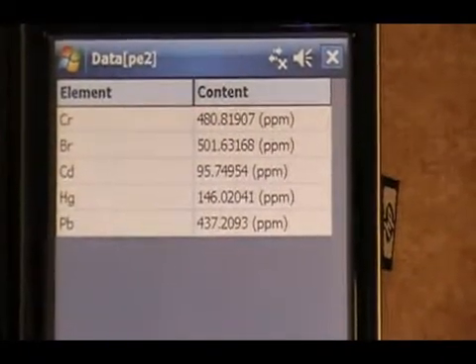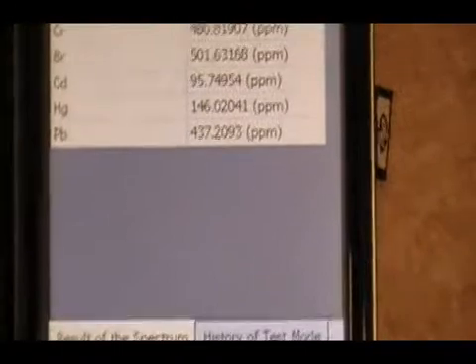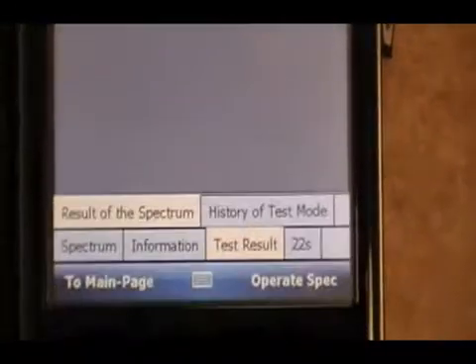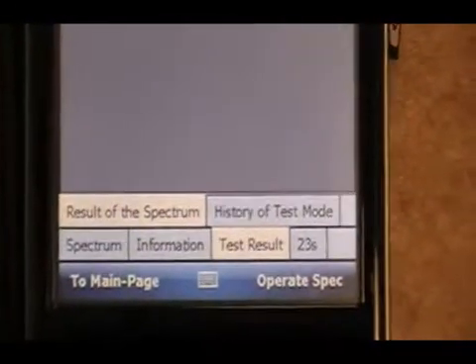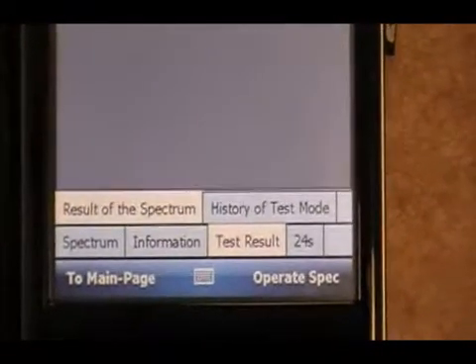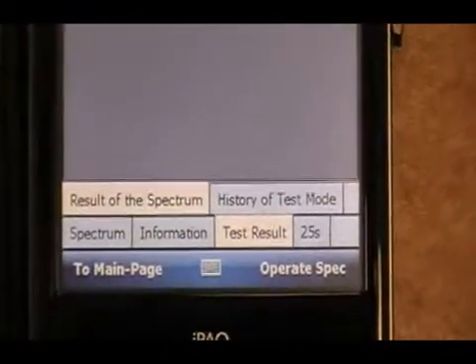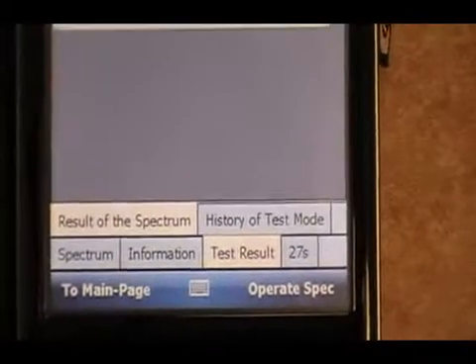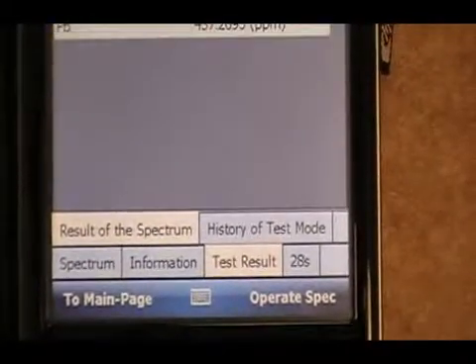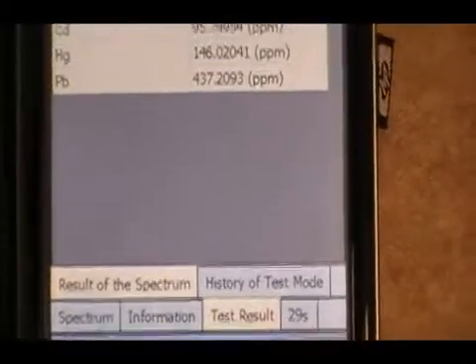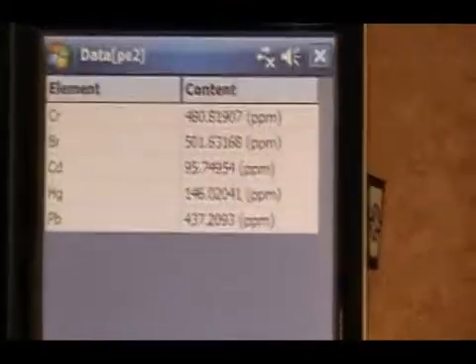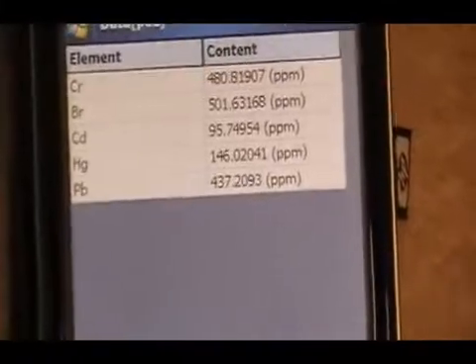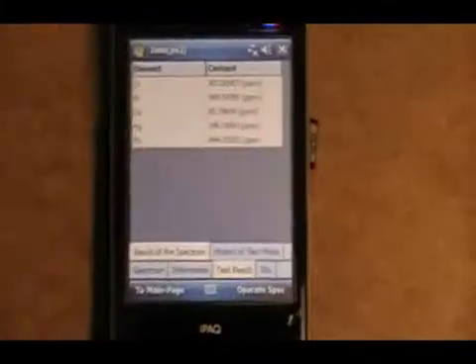So as you can see, until you get to these limits, anything else is really non-detect. And that's really what we're looking for with this kind of machine, is a non-detect number.